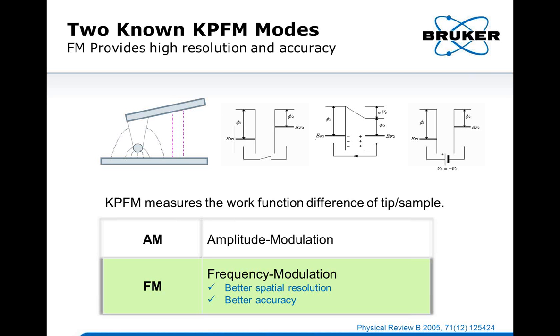Let's step back and take a look at the basics of KPFM. We have an AFM probe and a sample, and when we bring them close together, we can model that as a parallel plate capacitor.